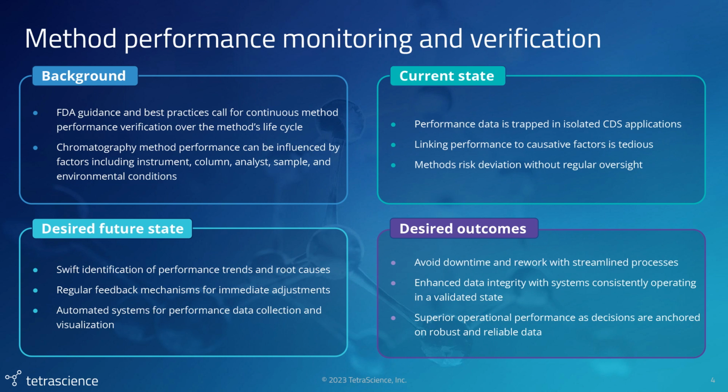These capabilities lead to several benefits, including reduced downtime and rework via streamlined processes, enhanced data integrity with systems consistently operating in a validated state, and of course, superior operating performance from data-driven decisions.